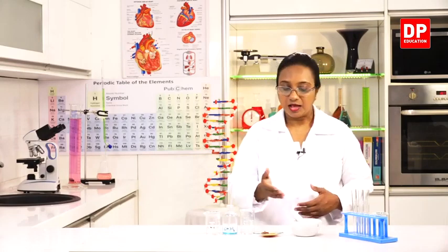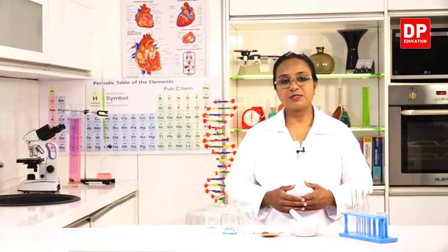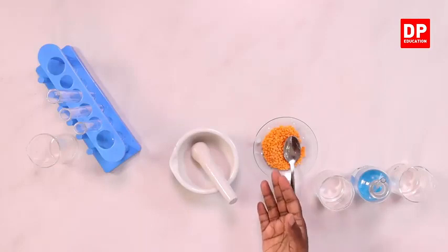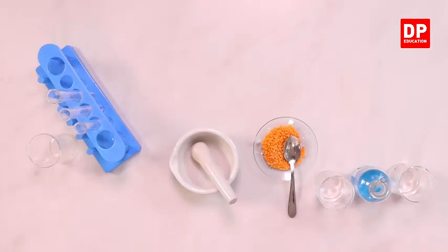Okay students, now the activity to test for the presence of protein in food samples. As you know, there are different types of food that contain protein. Dal is one of those substances. You can also use egg white for this activity, but for now I'll be using dal.